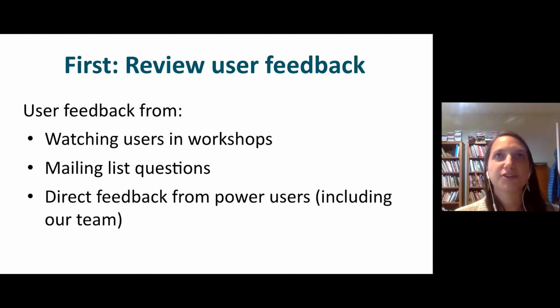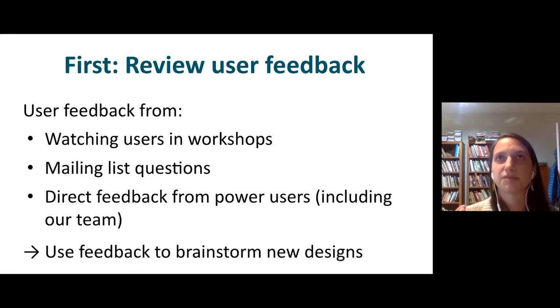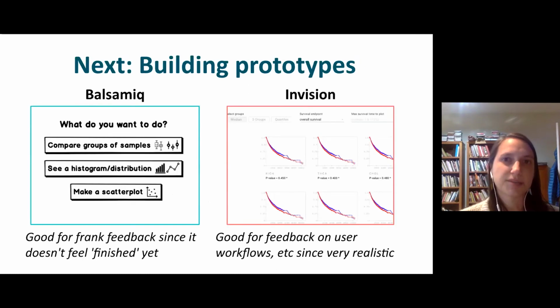And then we also solicited direct feedback from power users, including people from our team. These are people who are using Xena very frequently, and we just talked to them, seeing what little tweaks or bigger features would really help push their analysis forward. And we took all of this feedback and used it to brainstorm some new designs. Then we started building prototypes of them.